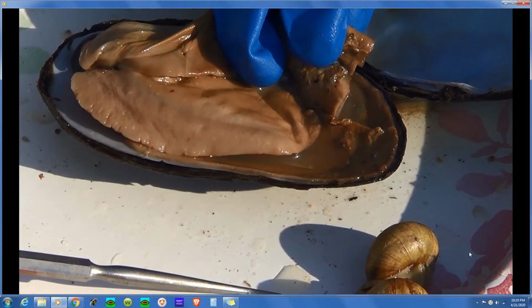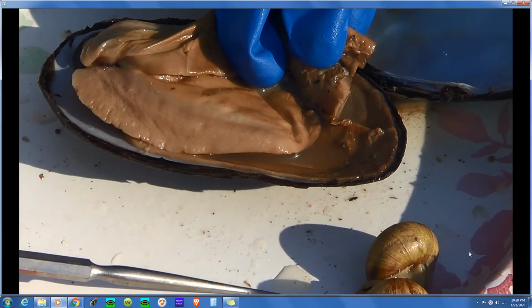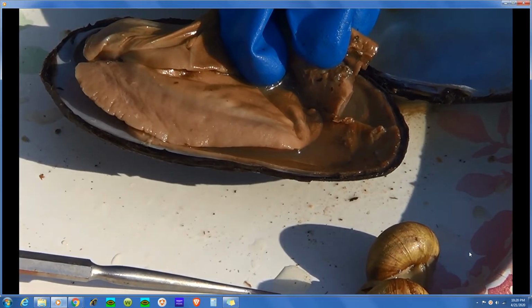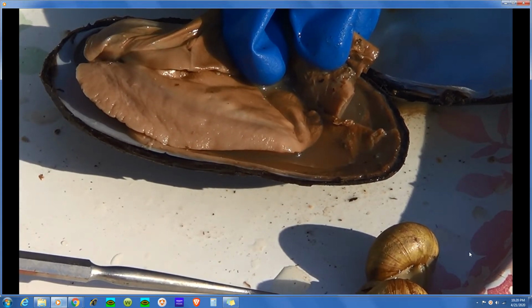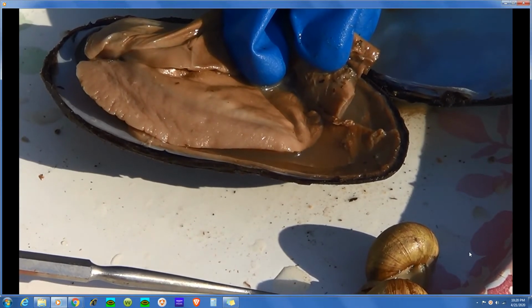Okay. Now, going back to circulatory system, for us, we have a closed circulatory system, which means our blood is always in blood vessels. Okay, it's in our heart, then it's in arteries, then it's in capillaries, then it's in veins, then it's back in our heart again. Fluids leak in and out, but the blood cells stay in. Materials can be absorbed, materials can be given off, but the blood itself stays inside the blood vessels.